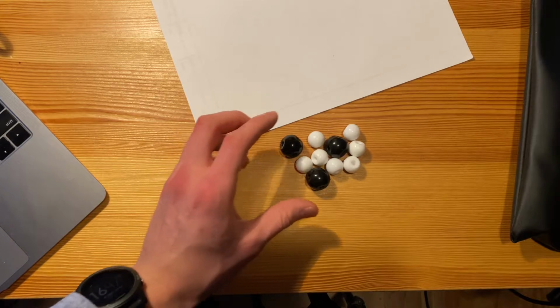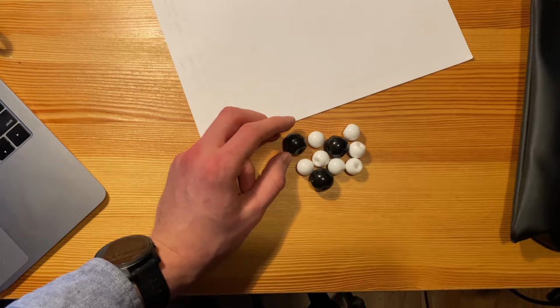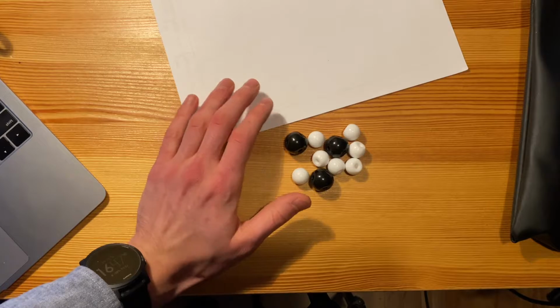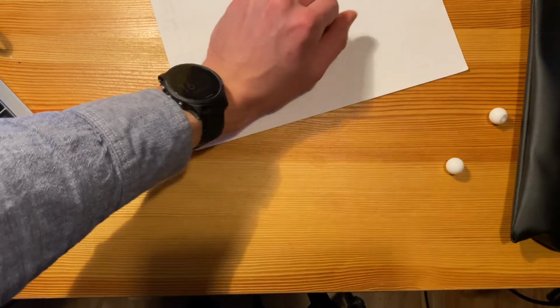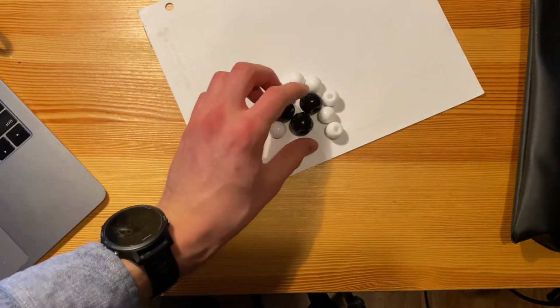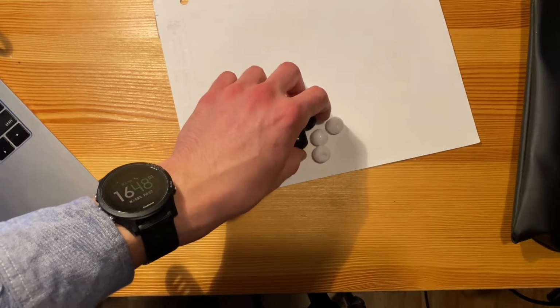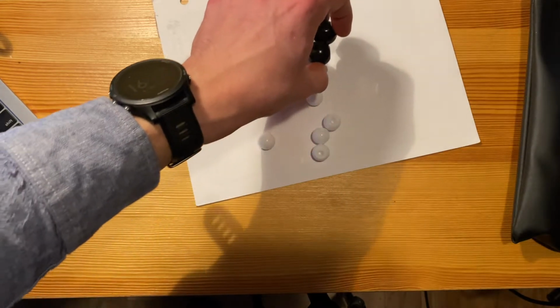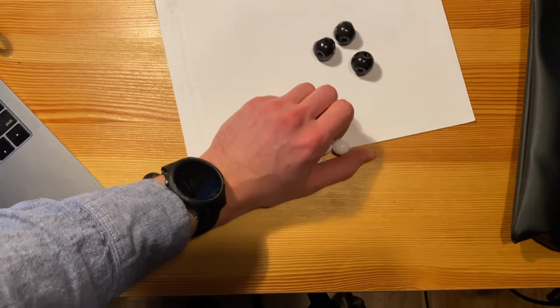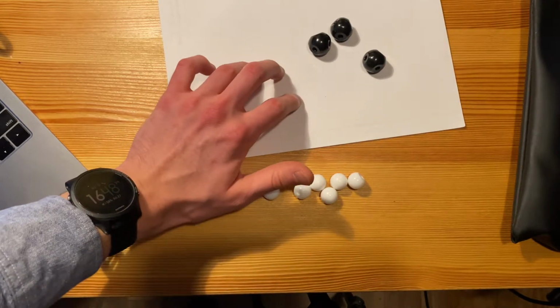So what we end up doing is we want to get rid of these black balls, and these are what we want to have left over. So what we're going to do is mix this with a solvent, and because the solvent is going to be immiscible with the mixture, what we don't want is going to stay with the solvent, and the rest of what we actually want will stay out. So we can separate the two and get rid of the stuff that we don't want.